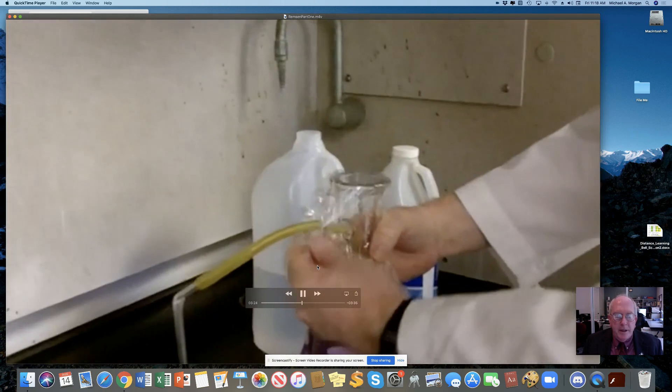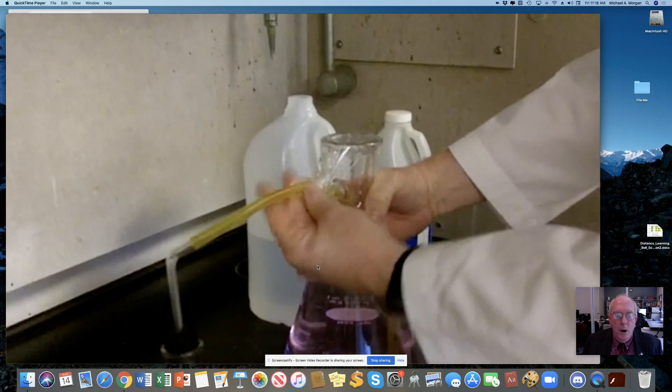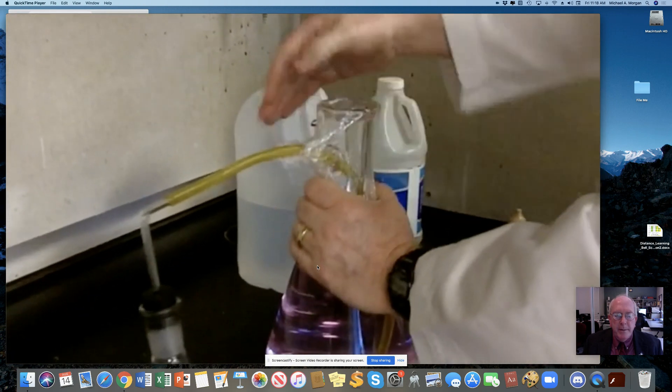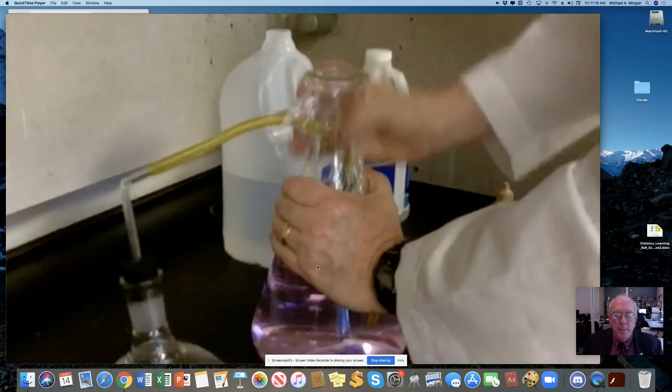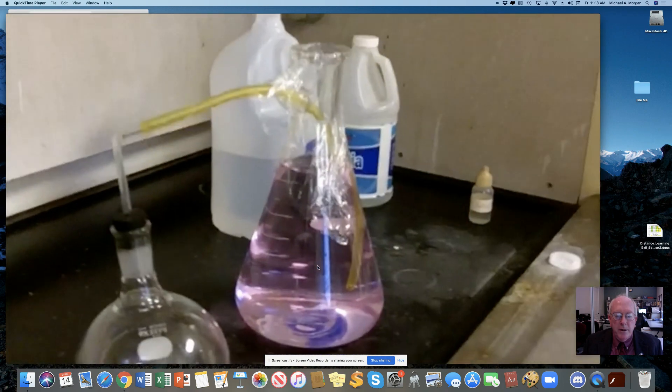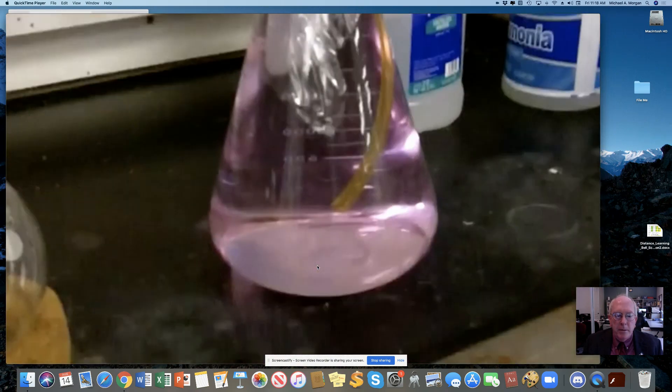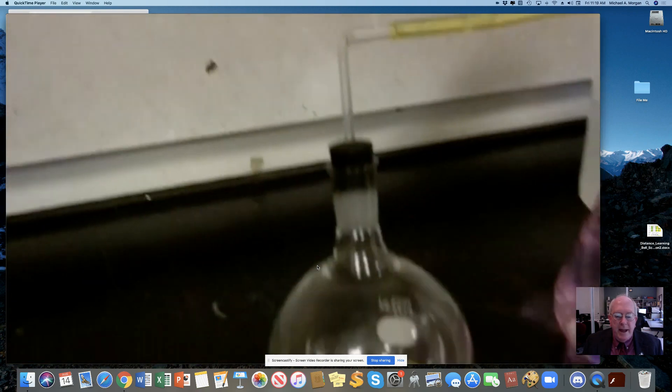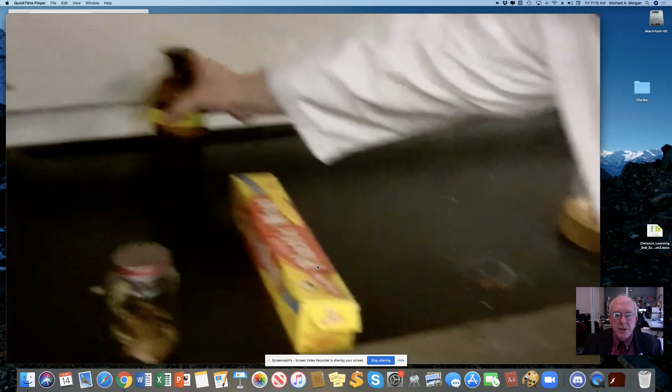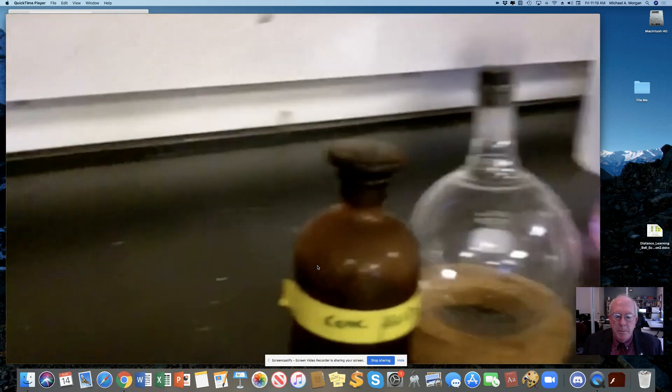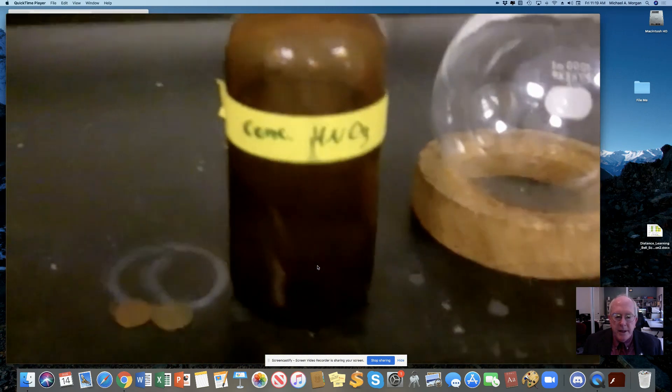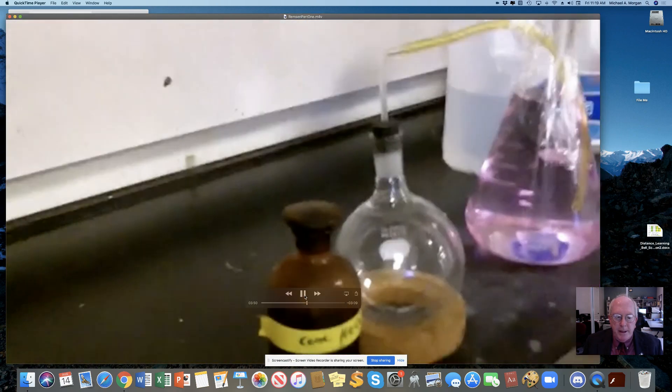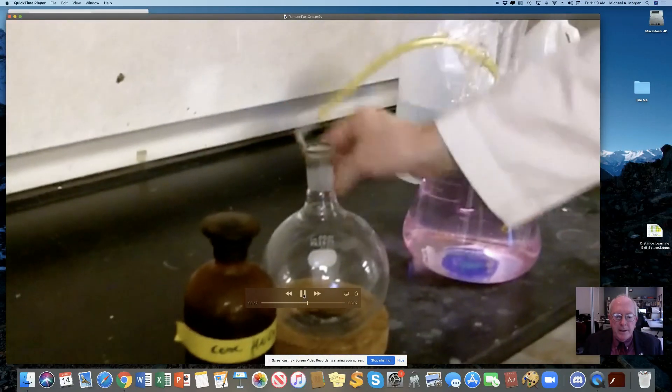And I am connecting these two with a piece of glass and some rubber tubing. I have sealed up the top of the large Erlenmeyer flask with some plastic wrap, like you'd use in the kitchen. And then in that flask on the left, there's a rubber stopper that's been placed there. Now this is a bottle of concentrated nitric acid, and I have a couple of pennies right there.